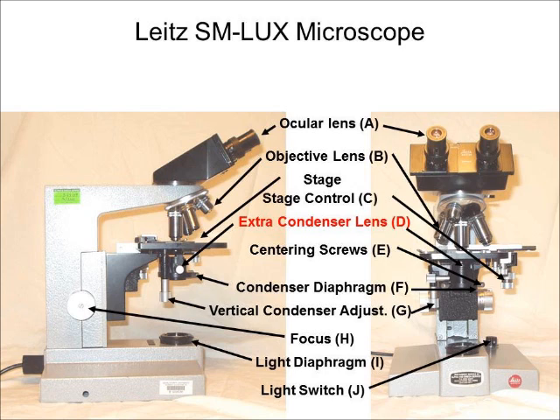Next is the extra condenser lens which is located below the stage and on top of the condenser. It is important to note that this lens comes into play when using objective lenses of 10x and higher, but not for the 4x lens. If you try to use the 10x objective lens without the extra condenser lens then the image will be blurry.